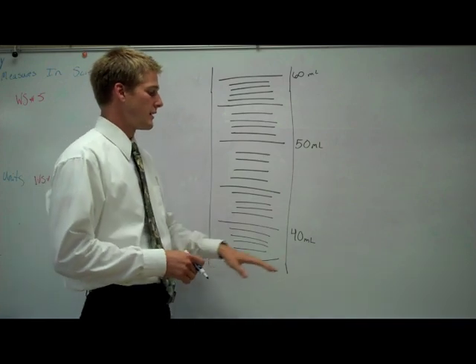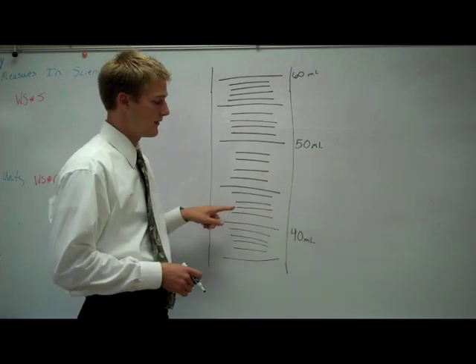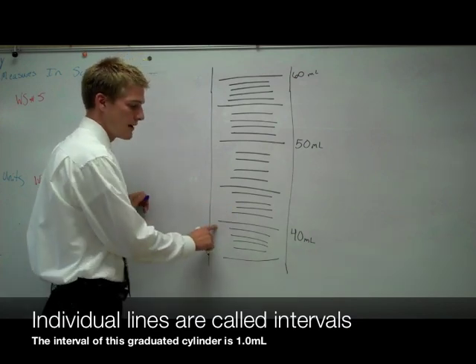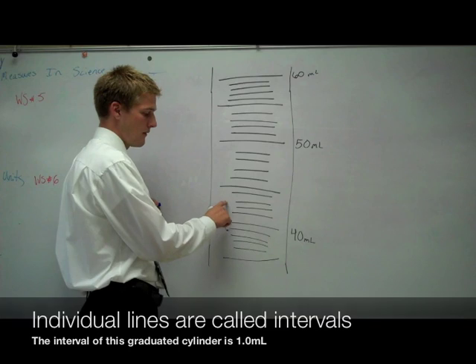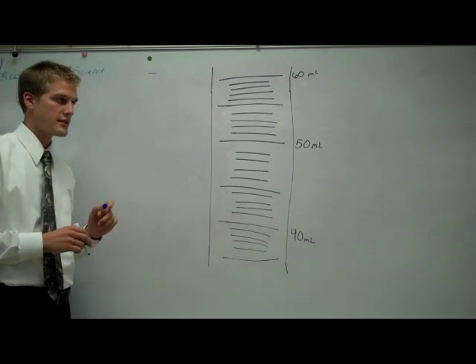This graduated cylinder goes by marked graduations of 10 milliliters, and then individual graduations of 1 milliliter. So, this is 40 milliliters, 41, 42, 43, 44, 45 milliliters. It's single graduations.